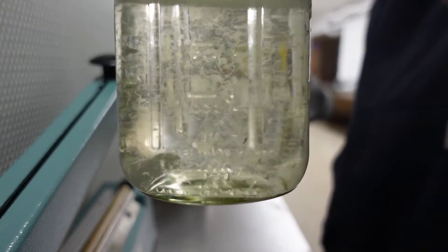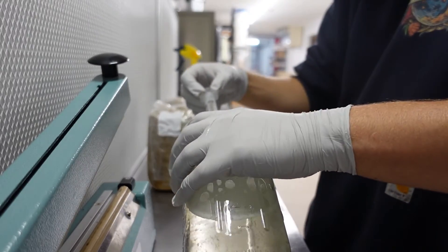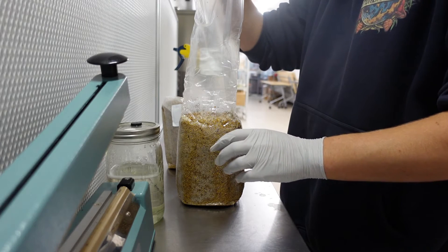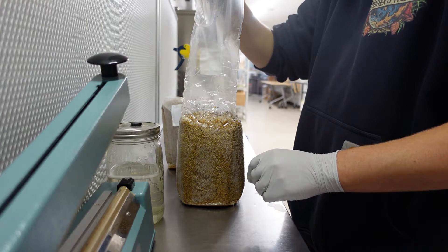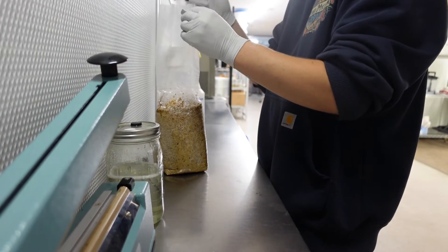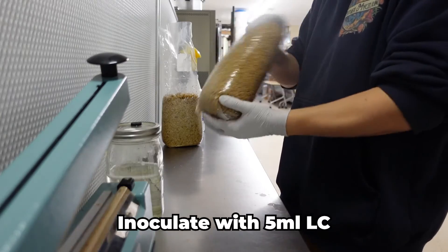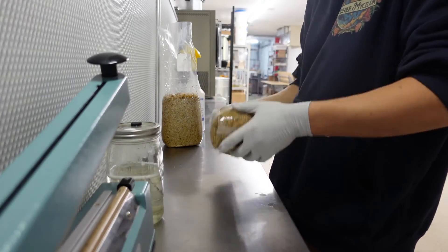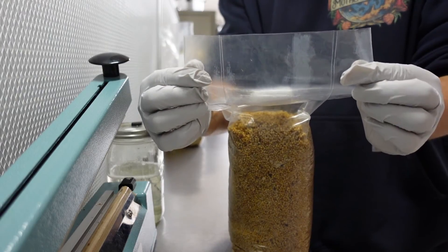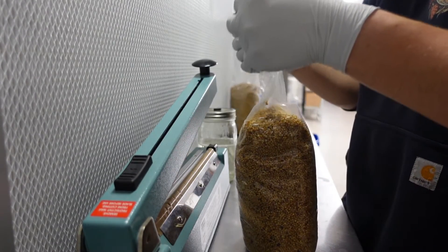Once your grain bags have cooled completely, you'll want to inoculate them with some liquid culture or do a grain transfer with another bag of fully colonized grain. Here we're just using some house-made Lion's Mane liquid culture, but you can also find syringes of liquid culture online. Now I'm inoculating each bag with about 5 to 6 milliliters of liquid culture. Once all of your bags have been inoculated, you'll want to shake them up to evenly distribute the liquid.